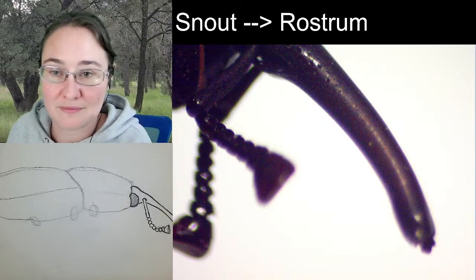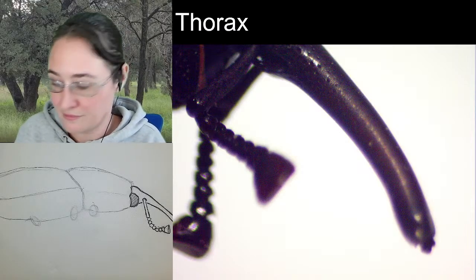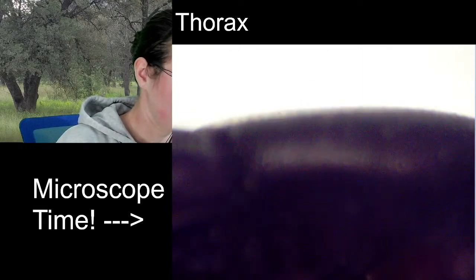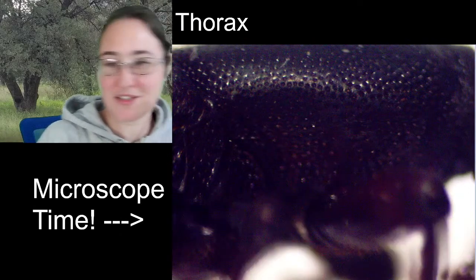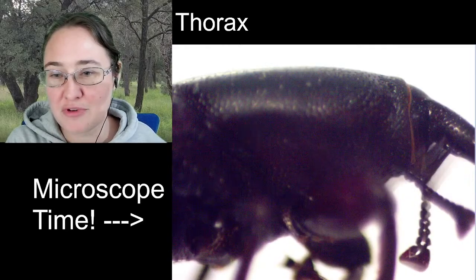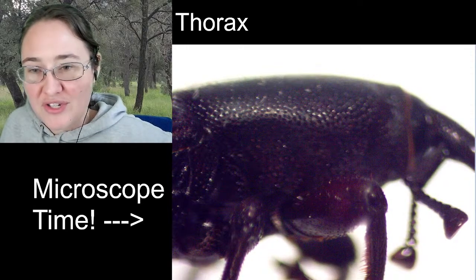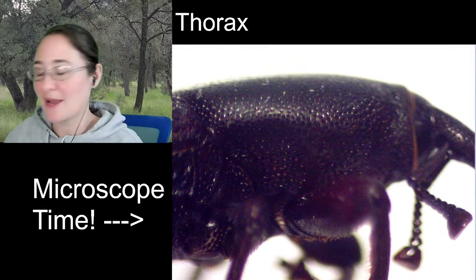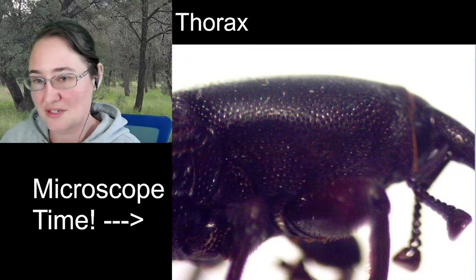Let's draw a pronotum. Things to look at. Okay. Well, let's get the pronotum first, and then we'll look at the legs. So, I wrote thorax because this is the first segment of the thorax that we're looking at. So, the thorax is divided into three segments, and they have three pairs of legs, so there's one pair of legs on every segment of the thorax. It makes it kind of easy for, like, muscle connections and stuff to just repeat it three times, I think.